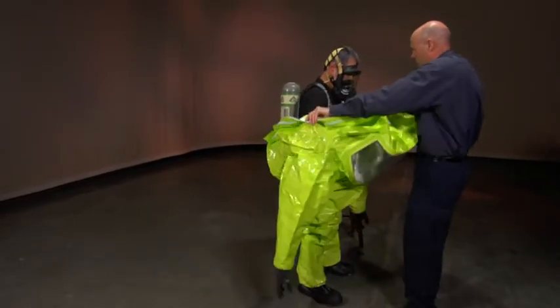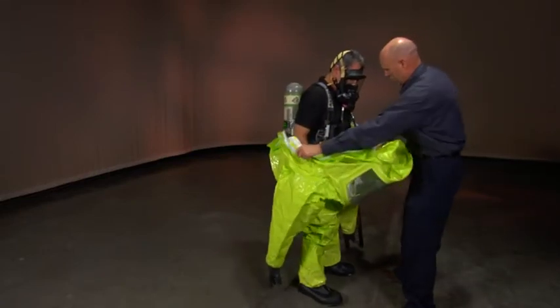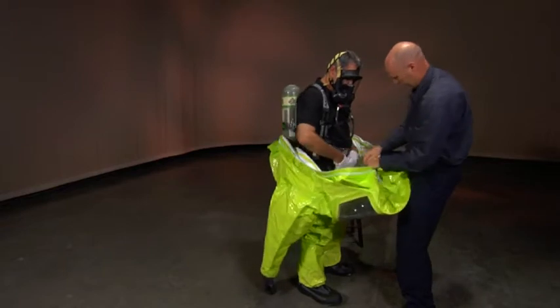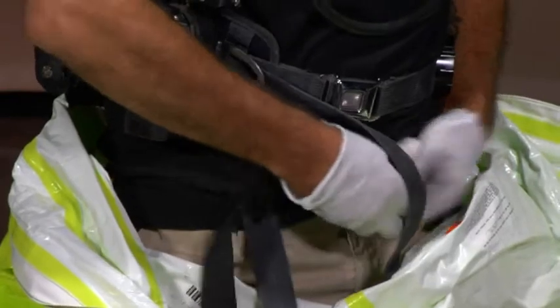Continue to roll the suit down over the wearer's shoulders. Have them remove their arms from the sleeves, but do not remove the suit in its entirety yet. Unhook the inner belt if present.